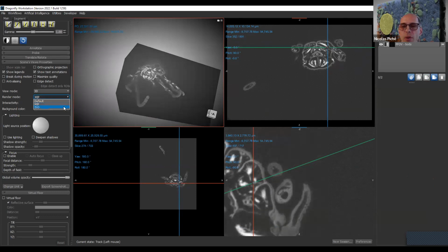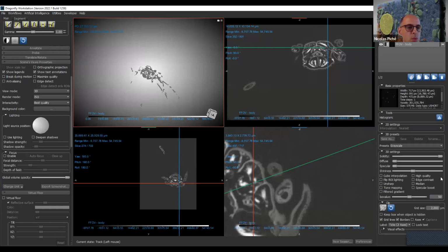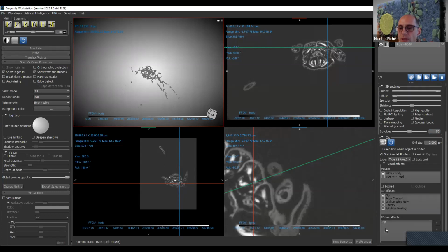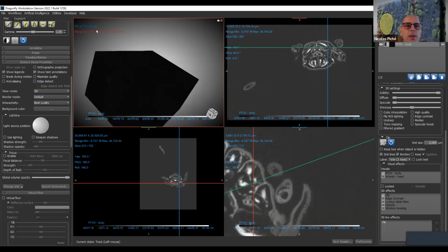ISO value is another function where you specify the ISO value. I'm not sure where it is. I must say that I'm not the expert in 3D. So somewhere there's a slider to change the opacity. Oh, maybe it's this one. No, okay. Sorry, ISO value. It's a bit tough for me. I don't know well how to use it. Now I can go back to a proper leveling.